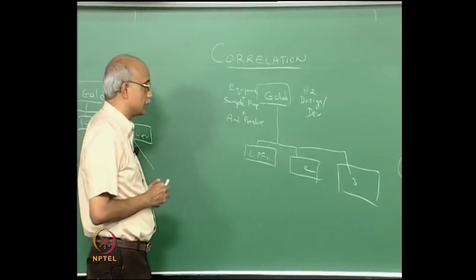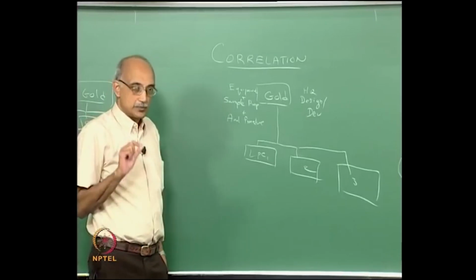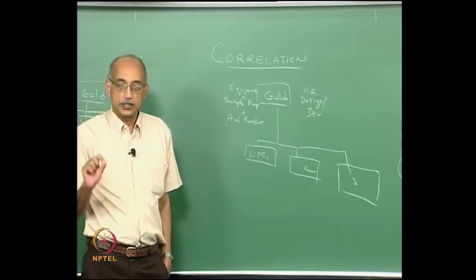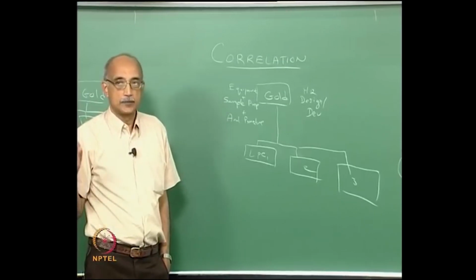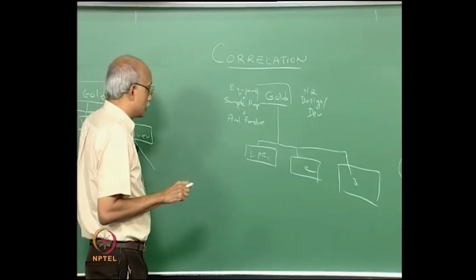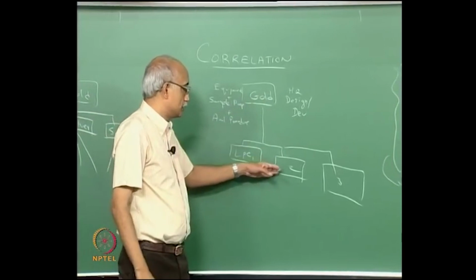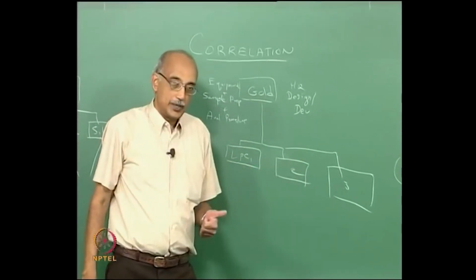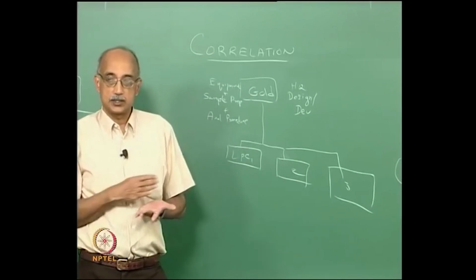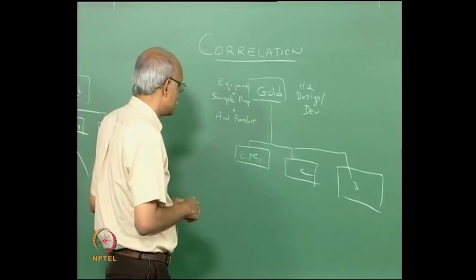It is a standard that is set by individual manufacturers using best practices in terms of how the sample is prepared, how the measurement is done, how the data are collected, how the data are recorded, how the data are interpreted, and so on. So this is a quasi gold standard, and it is used to calibrate and correlate various counters and size analyzers that are in use across various facilities.